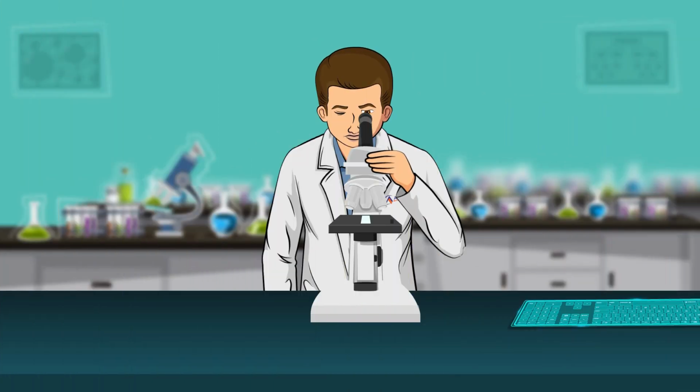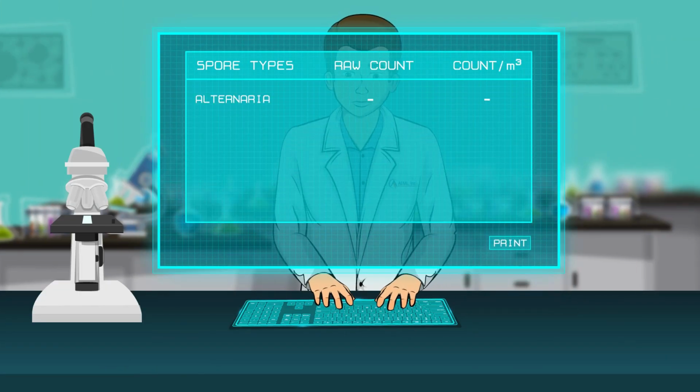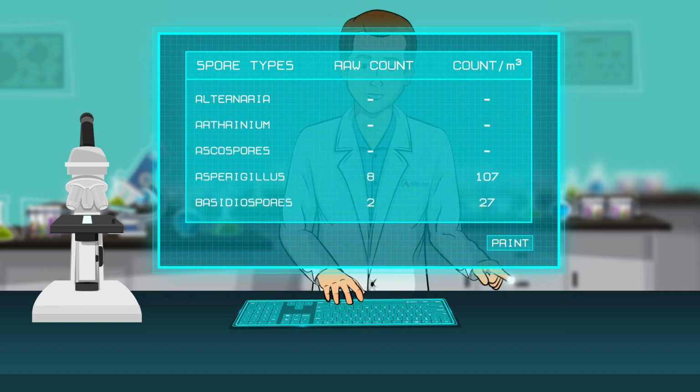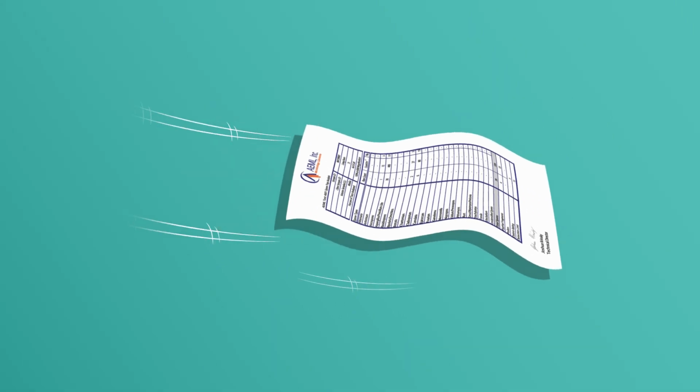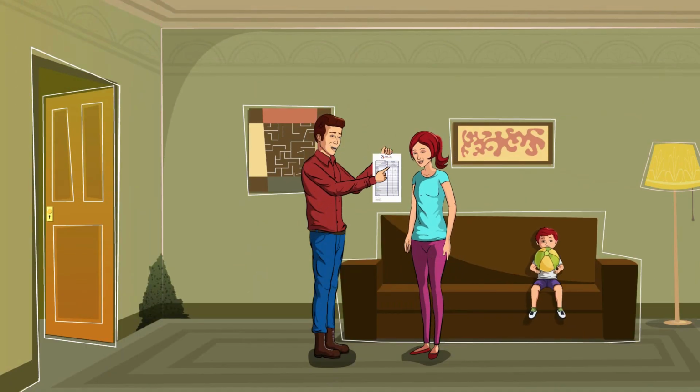Once the lab finishes with the analysis, using the flow rate and time in which the air was drawn into the cassettes, mould present in a cubic metre of air is calculated and a report is generated and sent back to the mould inspector. The mould inspector will then, in turn, explain the results to the client and determine if there are elevated mould conditions at the property.